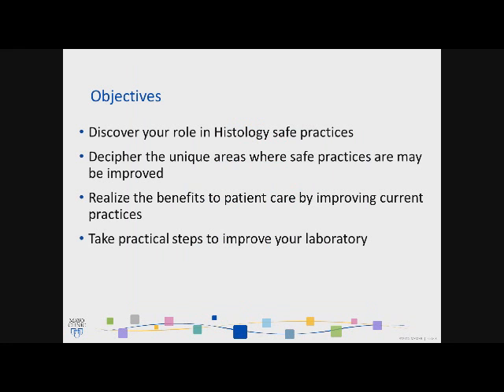And what we want to do today, and our objectives, are to really discover your role in histology safe practices. I'm going to give you a couple tools to improve your current practices, and if I hit on a couple things that really hit home with you today, I have been a success. I want to decipher the unique areas where safe practice may be improved. Someone once said, the greatest room in the world is room for improvement, and I really truly believe that. No matter how great and how far we've come, there's always room for improvement.